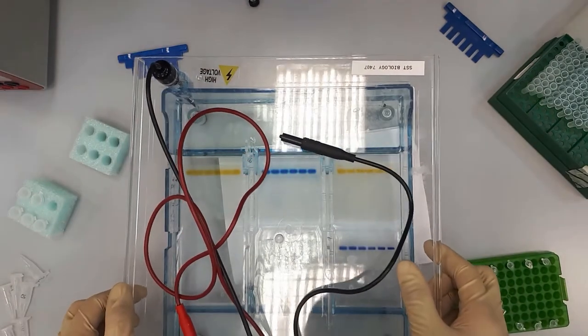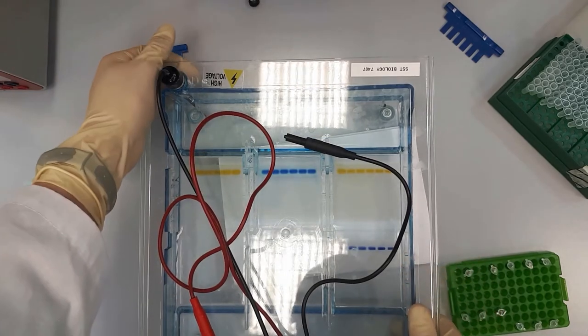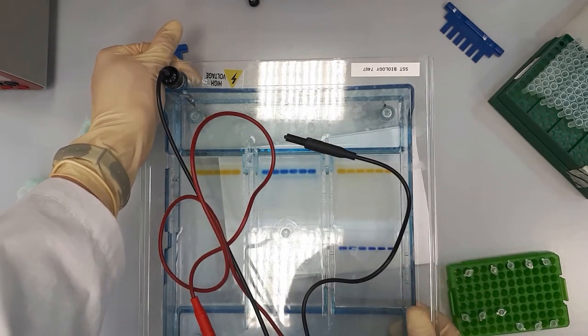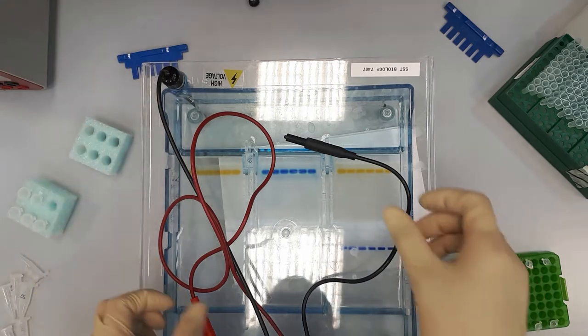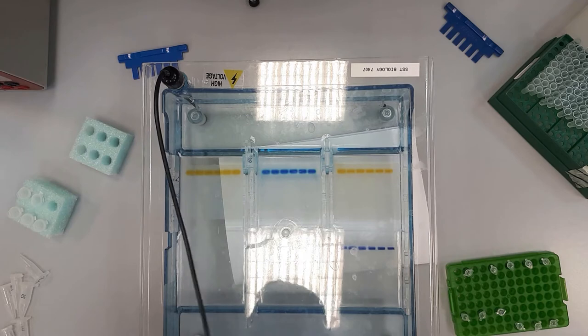We need to close our electrophoresis tray with a special lead. You can see the electrodes on this lead — we have two colored electrodes: one is red and another one is black.